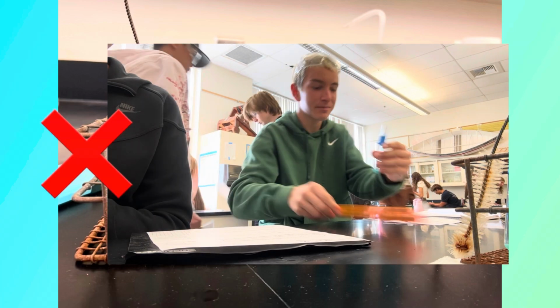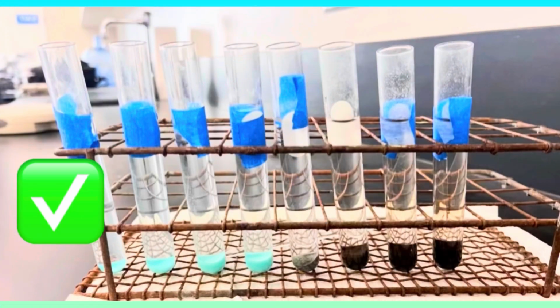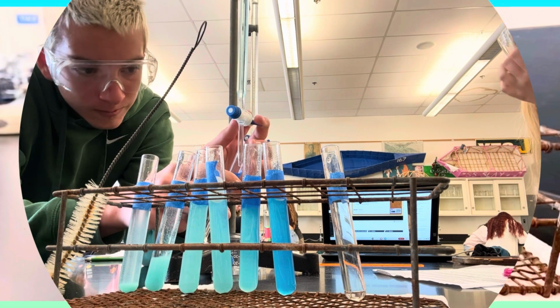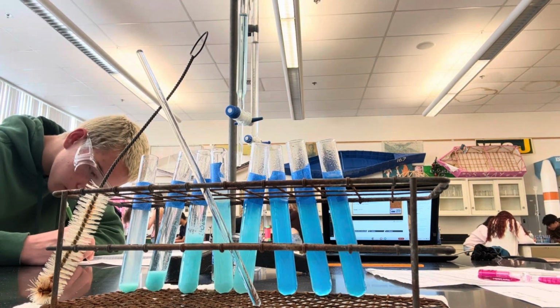Our results may have been more accurate if we had waited longer to measure, perhaps overnight. However, our magnified results did not hinder our understanding of the key takeaway of the lab. Also, though we did stir throughout the lab, we did not mix it vigorously enough initially, which may have resulted in skewed precipitate heights.